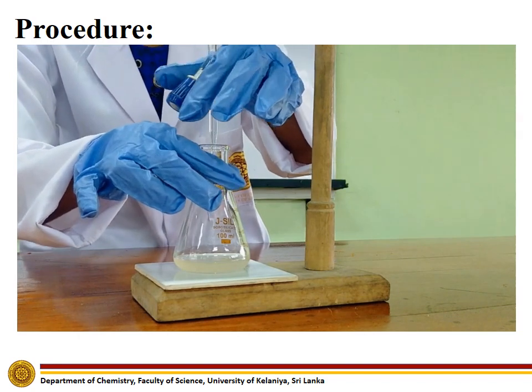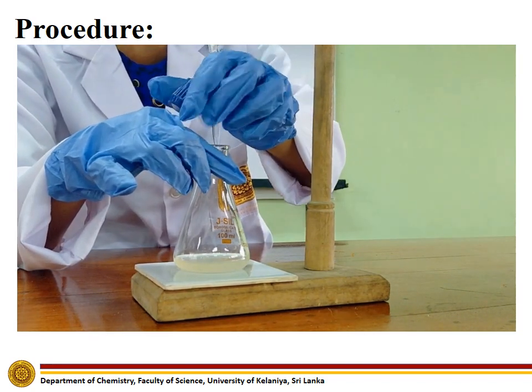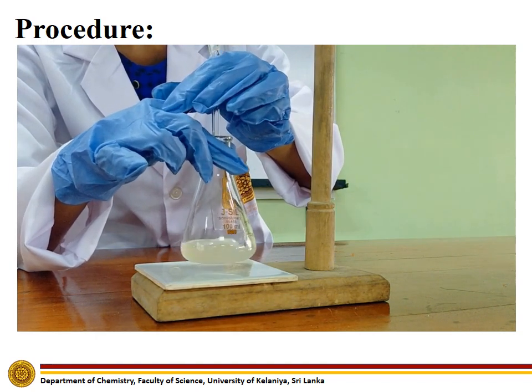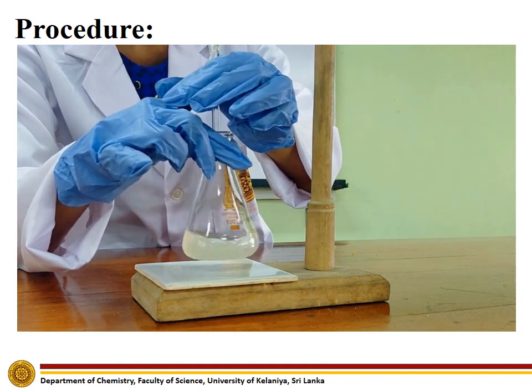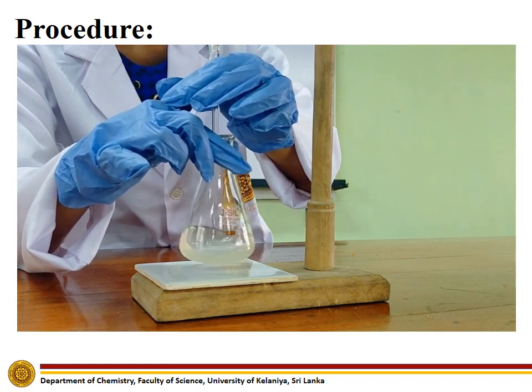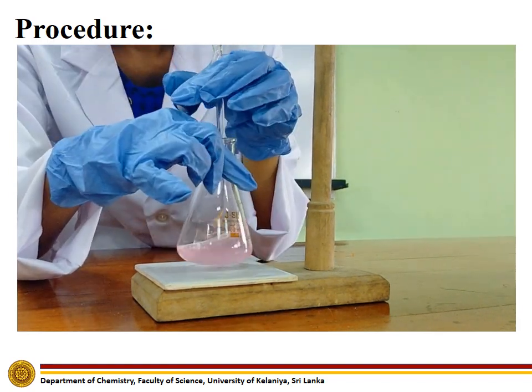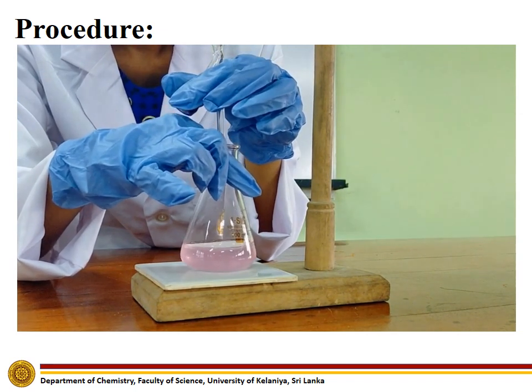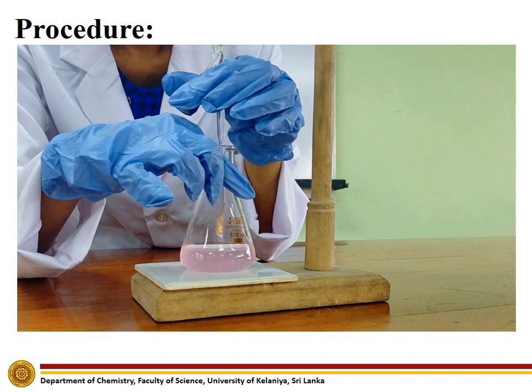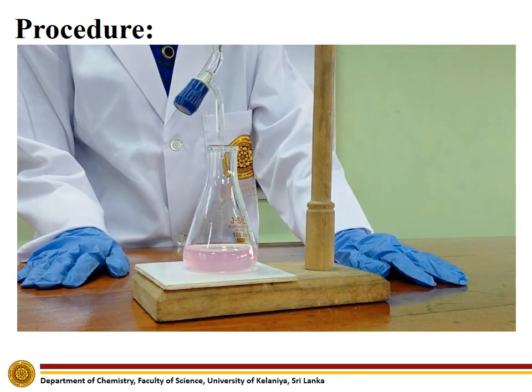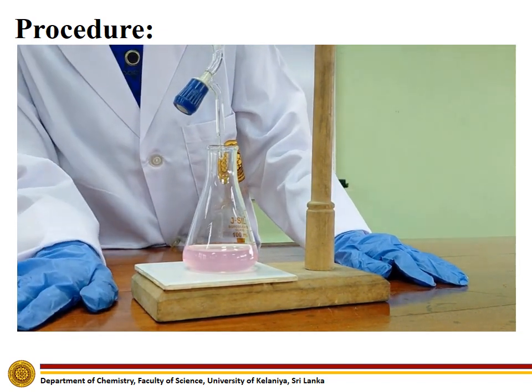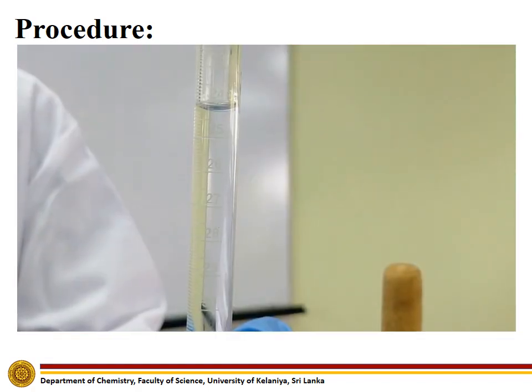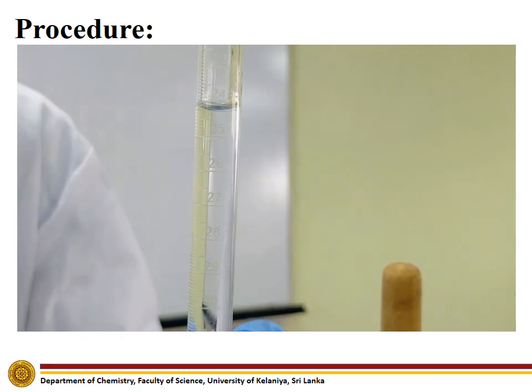Titrate the sample with sodium hydroxide solution until a faint permanent pink color appears, and then note the burette reading. The burette reading is 24.2 ml.